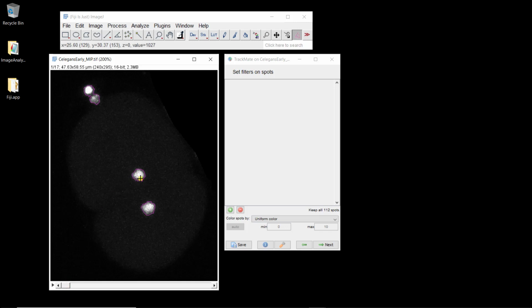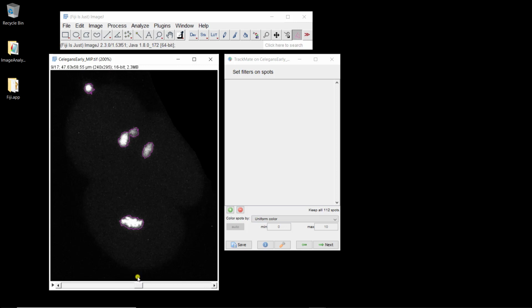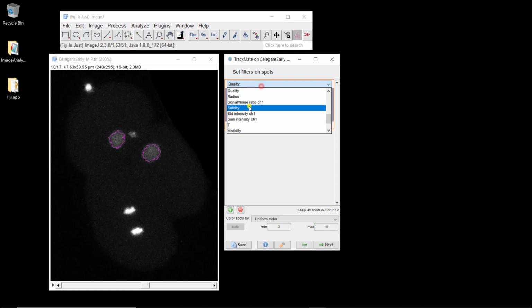And this is going to be probably the smallest size for my cells. But then if I keep going, I have some objects that might be smaller than this that I don't want to have, like this one. So maybe I can put a filter on the size. So let's just go to area.